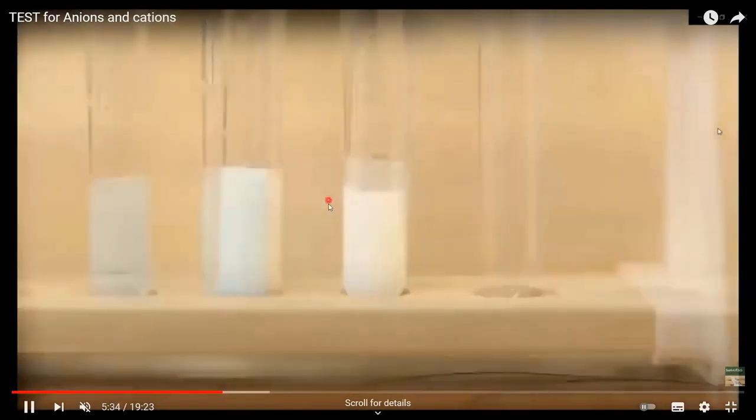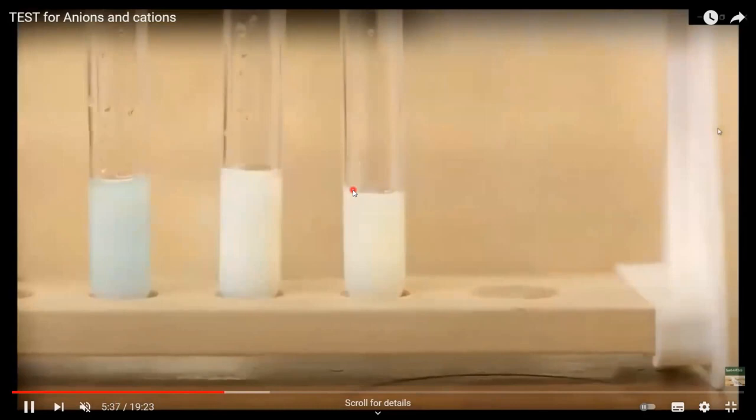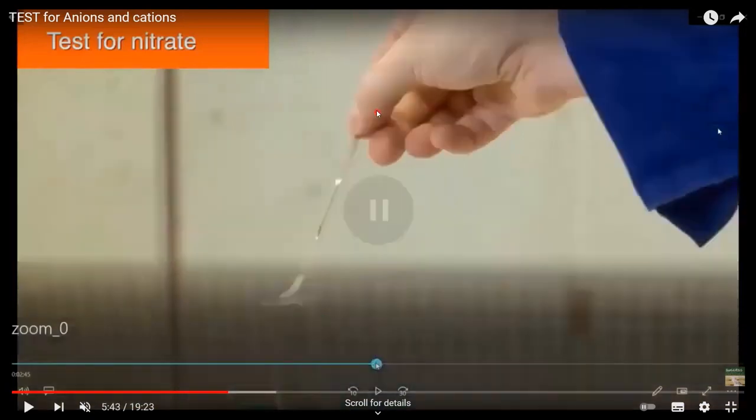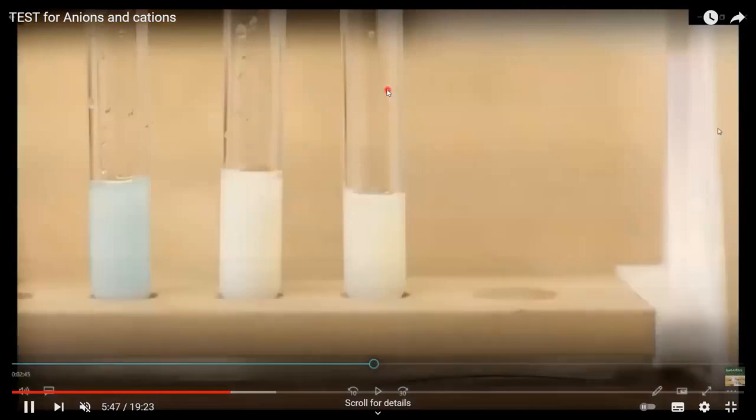This was a white precipitate. And then we add nitric acid followed by silver nitrate, and we'll observe a yellow precipitate. So you can see here silver chloride is there. This one is a cream color precipitate, silver bromide, and this one is a yellow precipitate. So it is silver iodide. This is iodide.